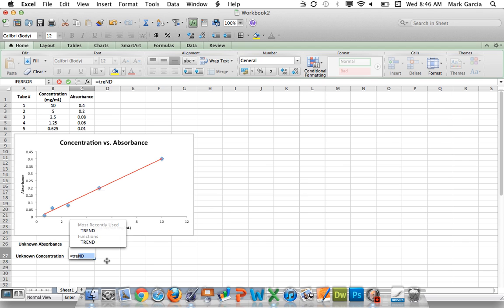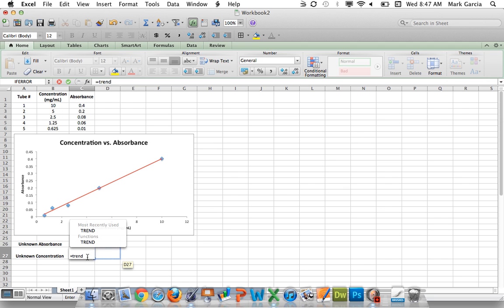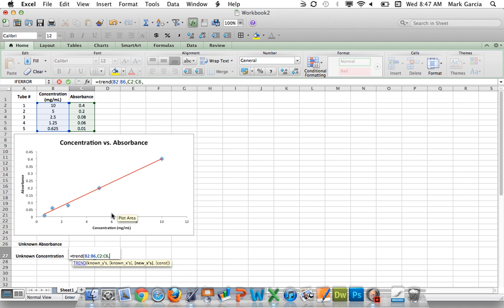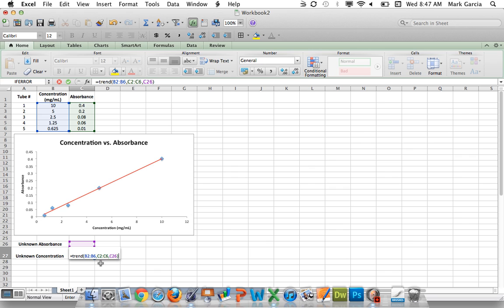So we're going to use a formula in this set of cells, and it's called TREND. It basically uses a set of data, takes a trendline off of that set of data, and calculates a new value based on a value you provide. So I'm going to put open parentheses, and my first set of values are going to be my X values, comma, and my Y-axis values. Then my known X will be this cell here to the right of my unknown absorbance. So this is where I'm plugging in my unknown absorbance, and I will close my parentheses.